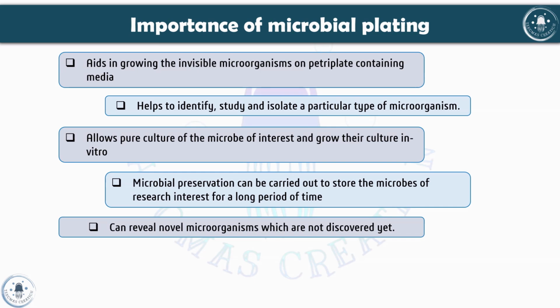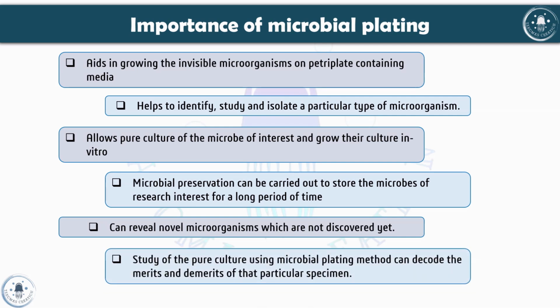It can also reveal novel microorganisms, as I said, which are not discovered yet. You can also reveal novel microorganisms. Study of the pure culture using the microbial plating method can decode the merits and demerits of the particular specimen. Right, we can study their nature, their virulent or non-virulent nature, their gene structure, everything can be studied.